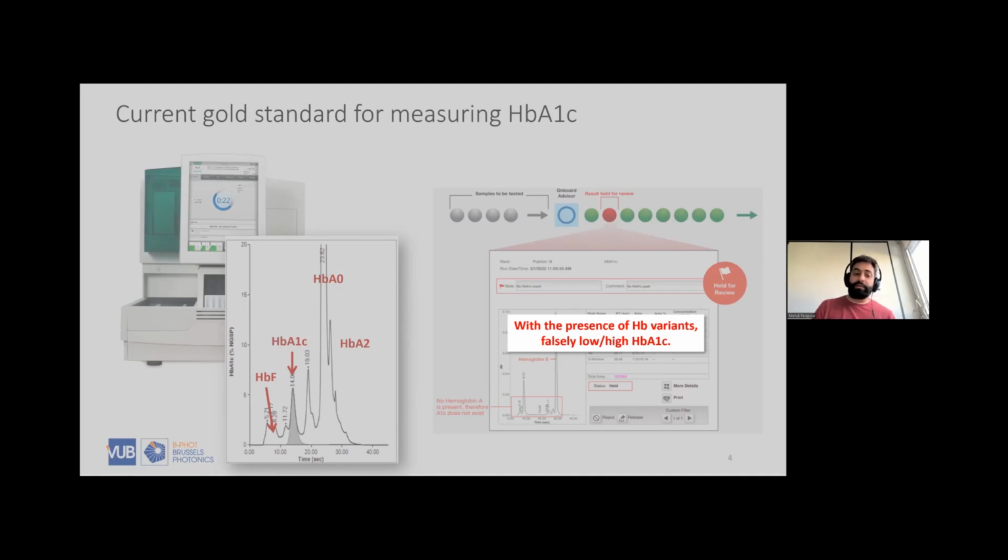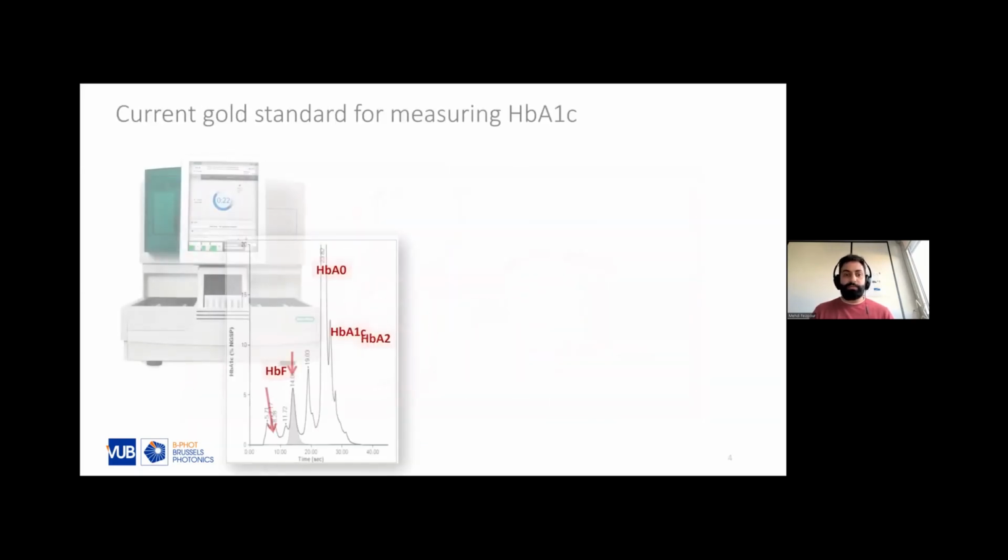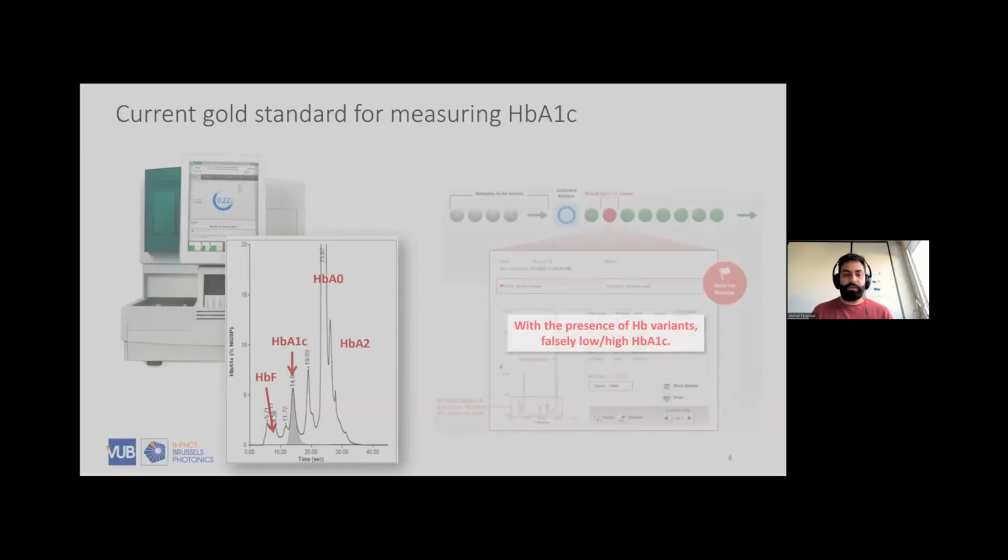Is it, I don't know, HbA, what was in the last slide? I forgot already. HbS. Is it an HbS that exists now in my results? In that sense, I know that whatever peak I'm looking at belongs to a certain category, a class, a fraction. Then I know that my concentration measurements with, for example, UV-Vis would correspond to that fraction specifically.